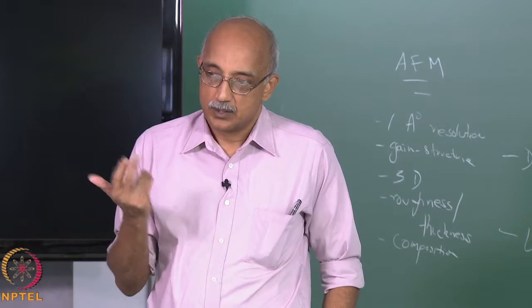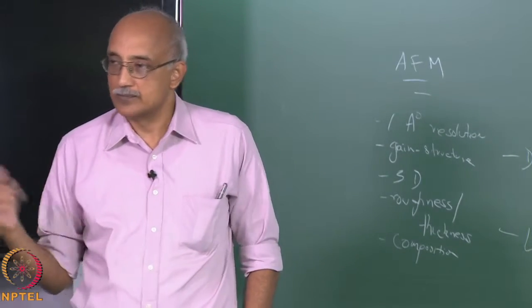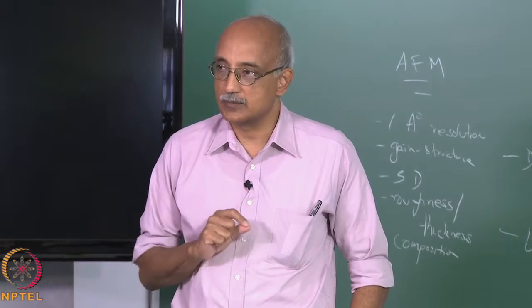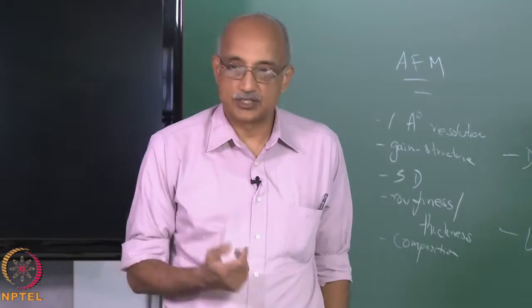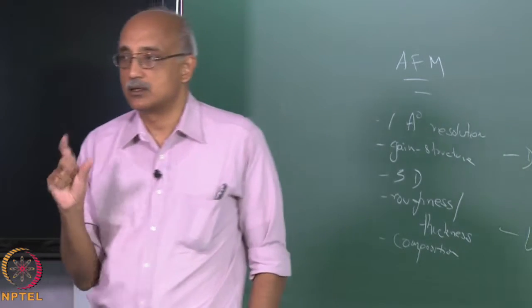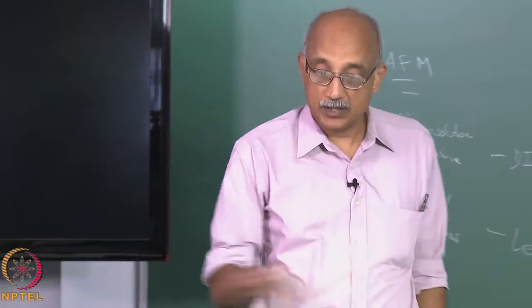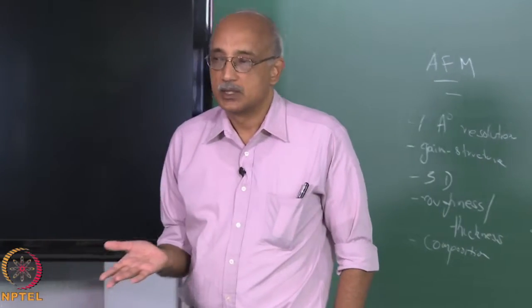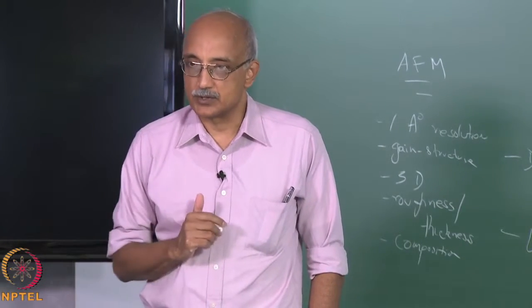So, for example, if your surface is silicon and your pin is, let's say, titanium oxide, there is a certain force associated with the molecular interaction between silicon atoms and the titanium. However, if the silicon now has, let's say, some impurity, adsorbed silane, then the interaction force will be different because the molecular character of the interacting surfaces is now different. So, again, provided everything else remains constant, if you have concerns that there is some impurity getting into your film, the AFM can be used to actually verify the presence or absence of this impurity.